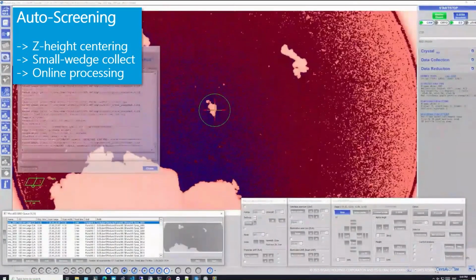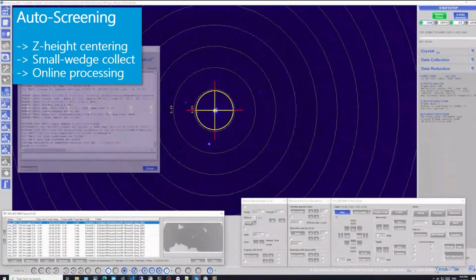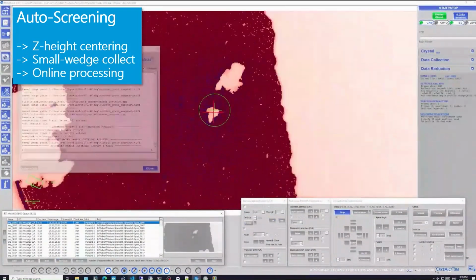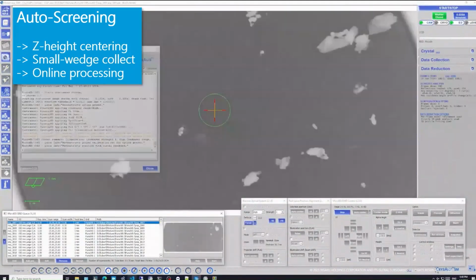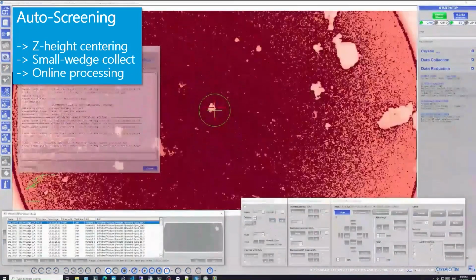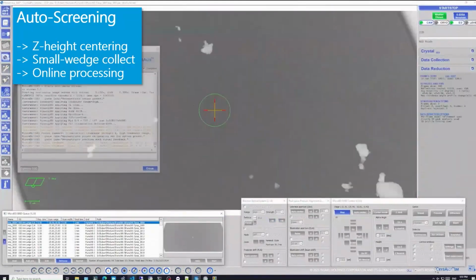So we're not that fast yet. We hope to push it significantly below 1 minute per crystal, including what you see here when the visual display turns like this funky red and blue, which is that the machine automatically centers the crystal on the rotation axis of the goniometer using image processing. This is quite reliable with quite a sophisticated algorithm. It's trickier than it seems, I should say. So this works quite well now.